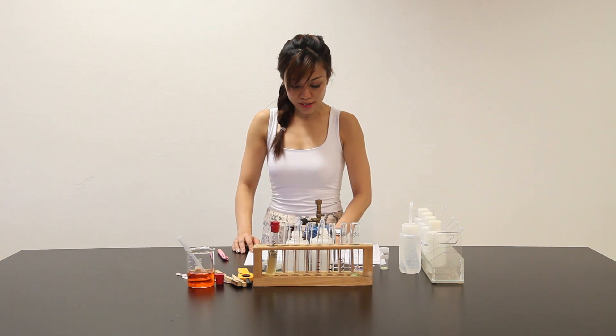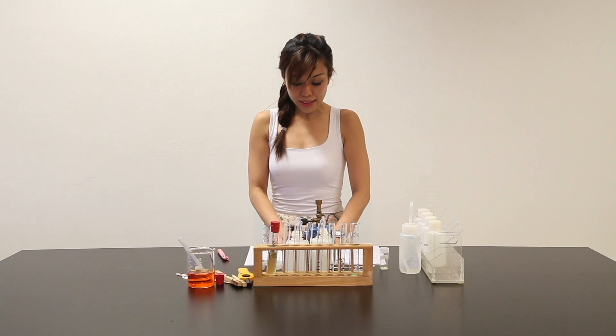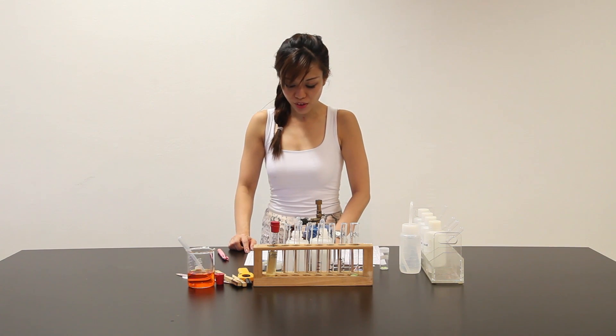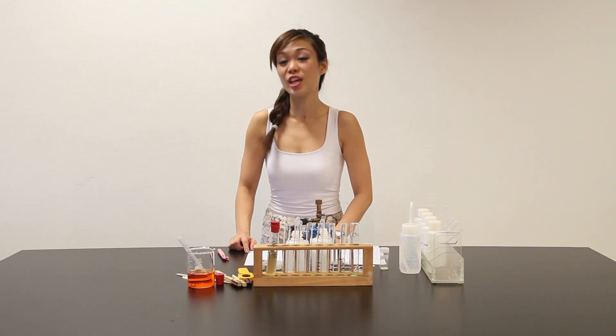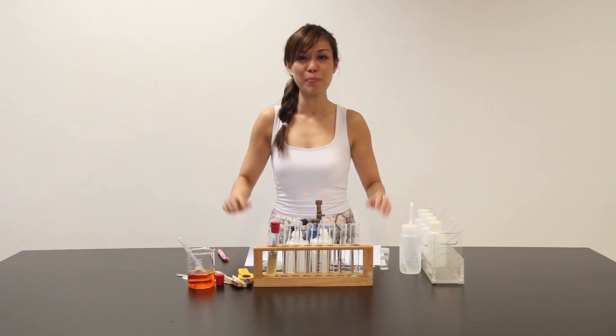And let's move on. They say consider the result of your experiment. Name the 3 ions that are present in SORT Q. Give evidence to support each of your choices. So that's it. We have finished preparation.